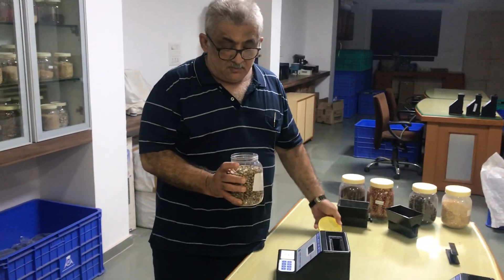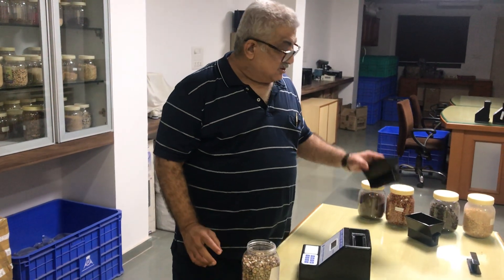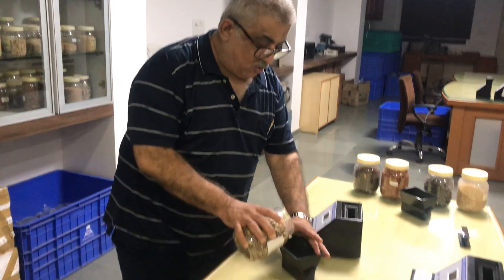Today I will demonstrate how to measure moisture content in castor seed. This is a hopper. You have to take the full volume of the hopper.